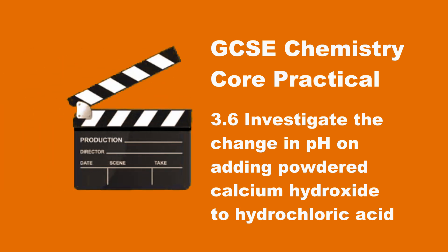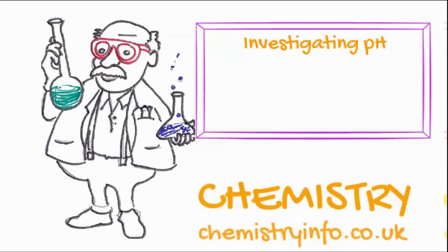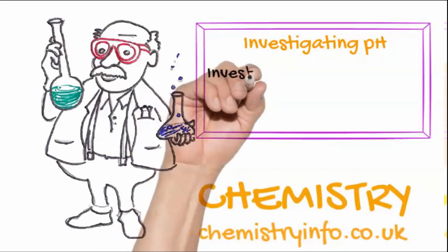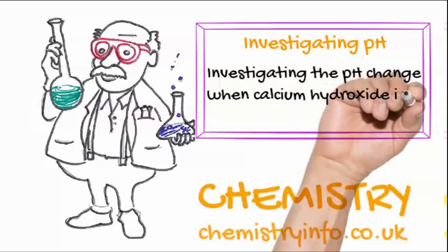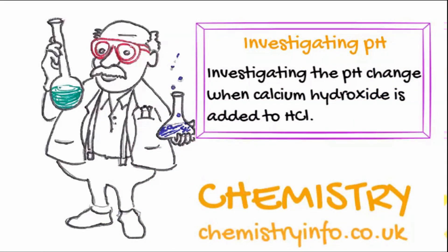GCSE Chemistry Core Practical. Investigating pH. Investigating the pH change when calcium hydroxide is added to hydrochloric acid.